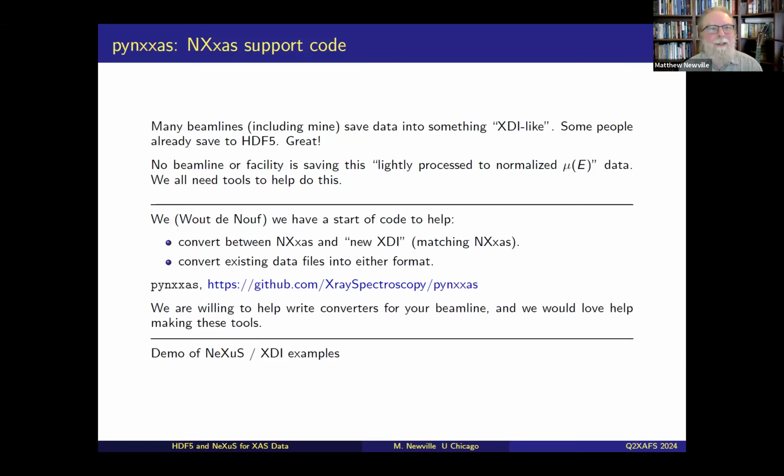We take data on mud, right? So there's no CAS number. Short of that, it's hard, but I totally appreciate that that's important to figure out how to make standardizable. But I also think that we're not the only ones to need that, because that's not about EXAFS. That's also about if you're doing SAXS or TEM, you might have the same issues. So it would be helpful for that to get solved. I think, yeah.